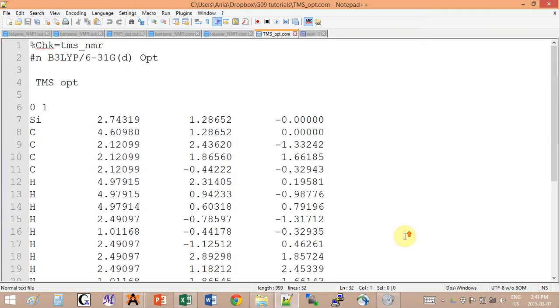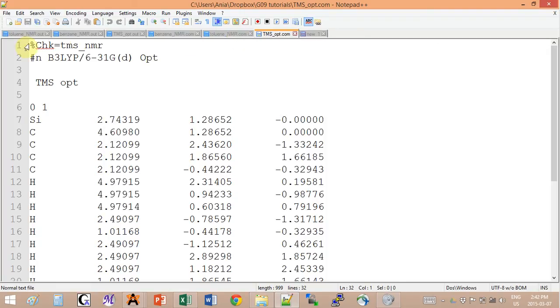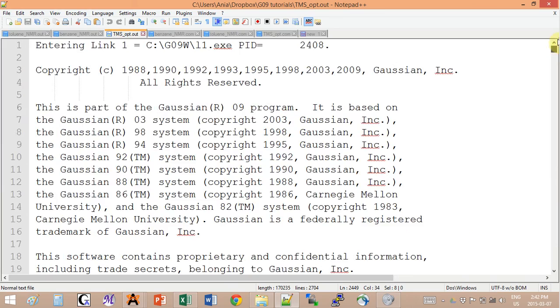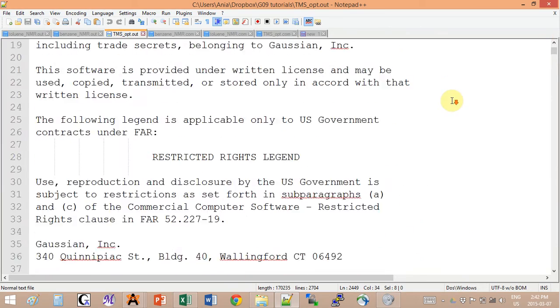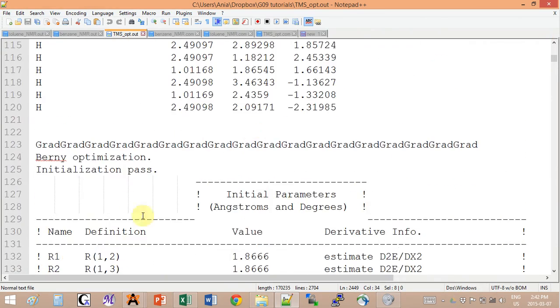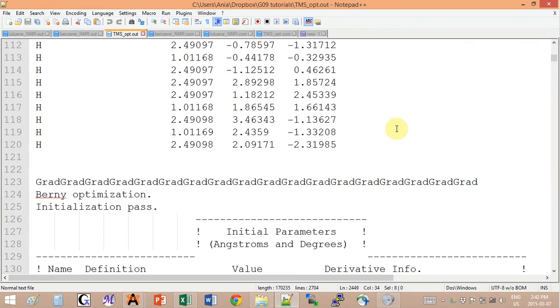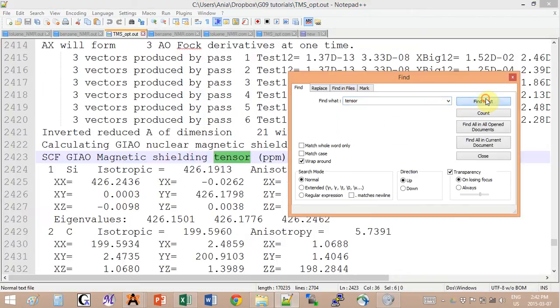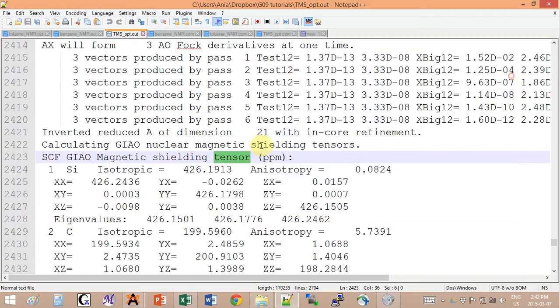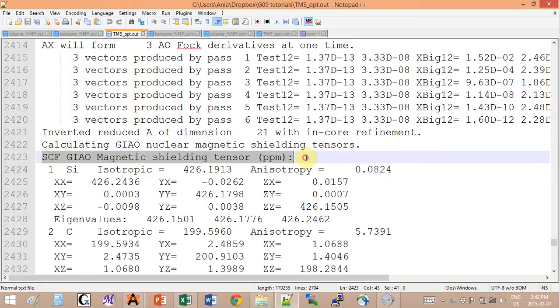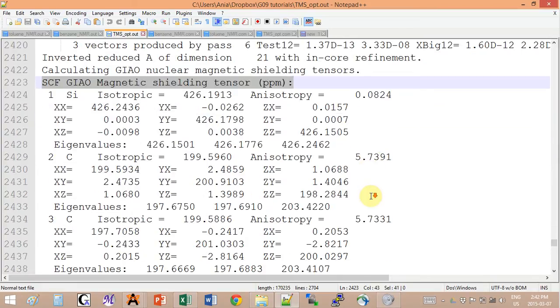The output of this kind of input looks like this. You will start off with the normal optimization parts over here, and once the optimized structure has been found, you will get to this NMR output. You can search for tensor as a keyword and it will right away jump to the NMR part output.